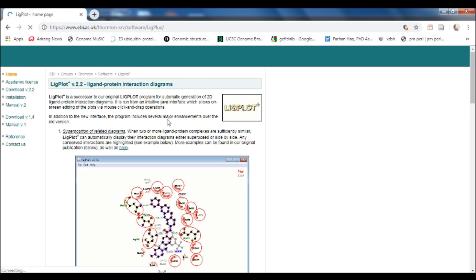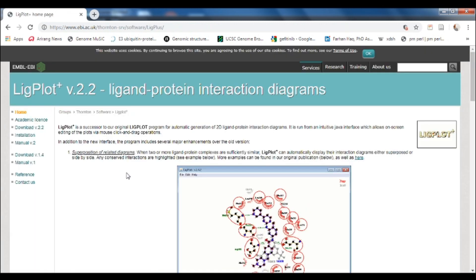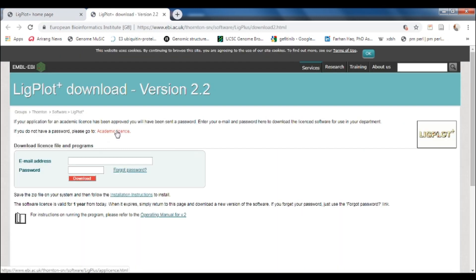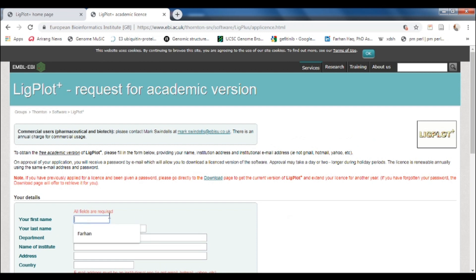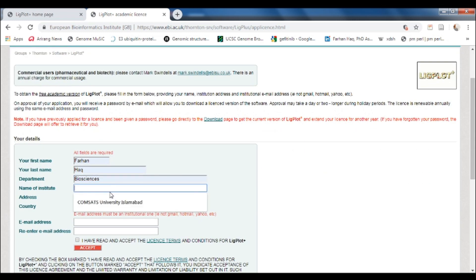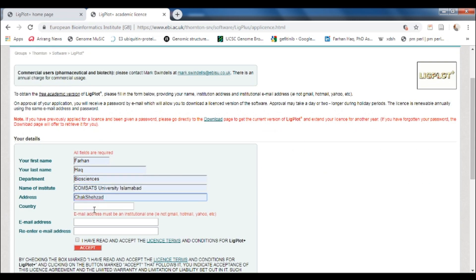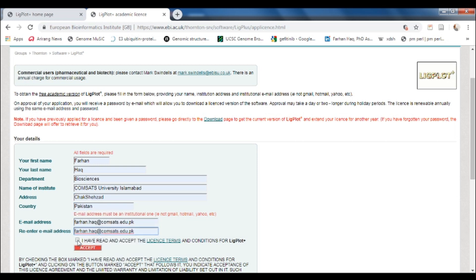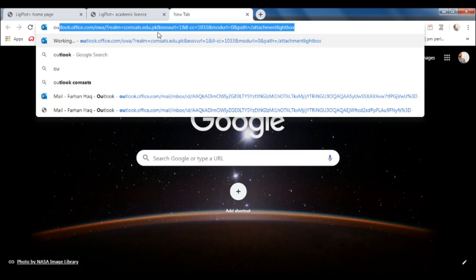First of all you need to go to the LigPlot Plus website and download the LigPlot software. For that, you have to register yourself and get the academic license. You just have to fill these forms with all your details. You need an institutional email address for this, and after doing all this you just have to click accept and it will send you an email.